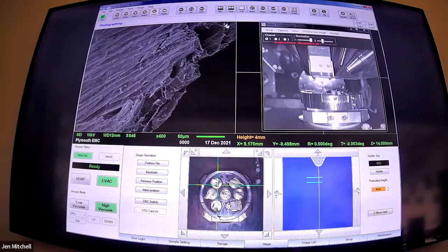We're looking into that smooth bark over the top of the pine cone. We'll take this last picture and then finish off on our fun sample - we'll be back on time I think. It's quite hard to stick to an hour - I get very excited about things we're looking at, and you never quite factor in how long it takes to take a photo. After last month's session I was still on the microscope for half an hour looking at more stuff because I got so excited about the filter papers.